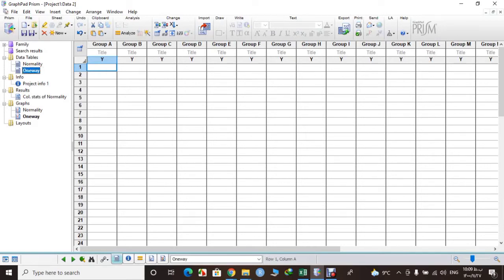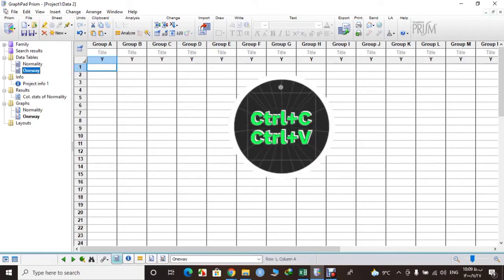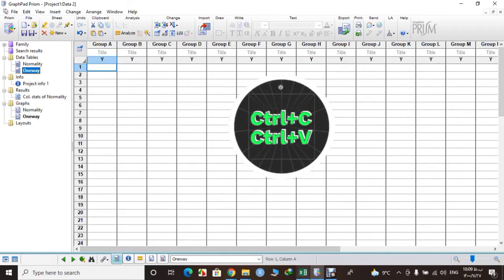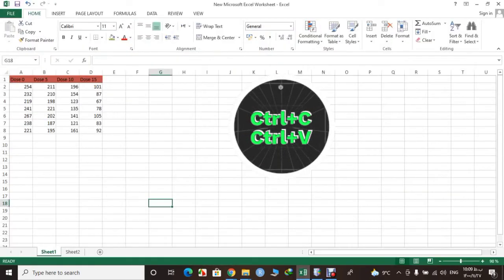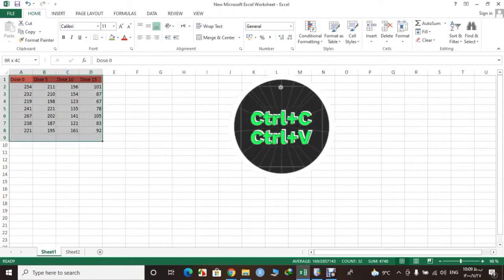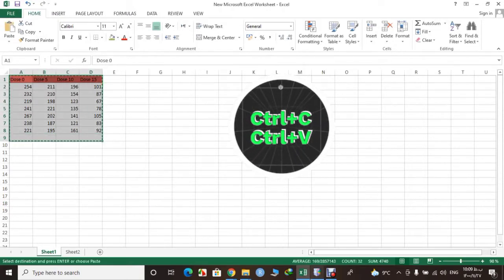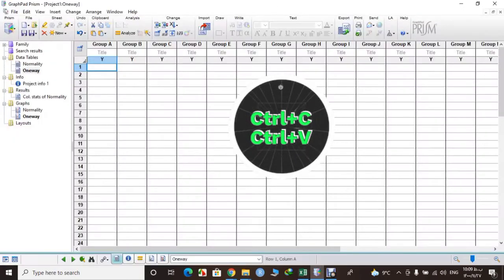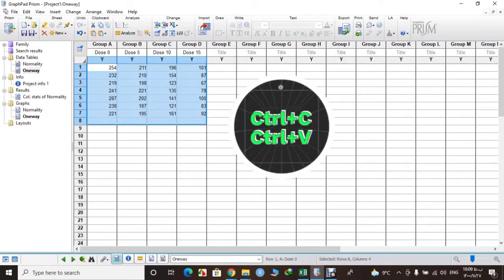Okay, now let's copy and paste our data from Excel file. Okay, let's copy them and just simply paste them in Prism. Now we have all our data.